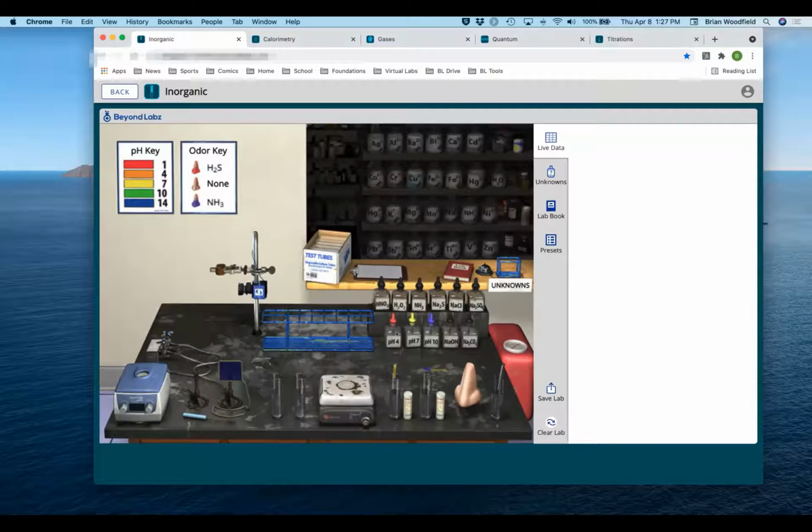We have made some additions that I think we're all really excited about. I'm not going to be able to demo all the labs, but if you're familiar with them, they'll be the same with new cool things. So hopefully you can see my screen here.